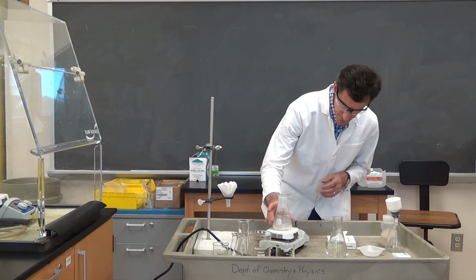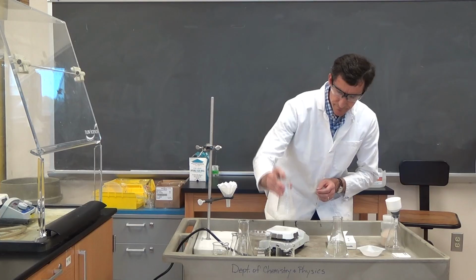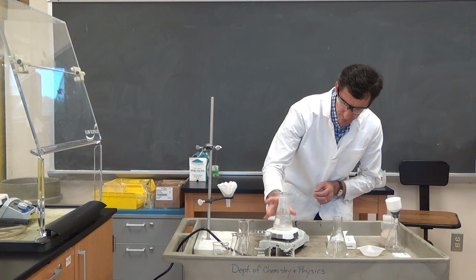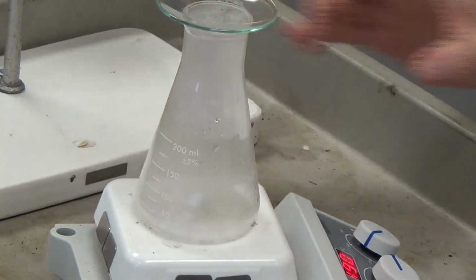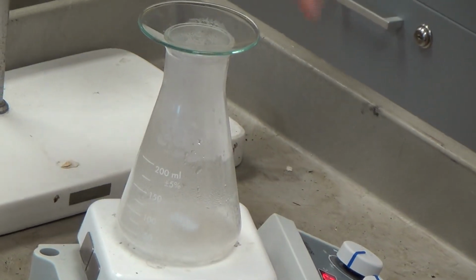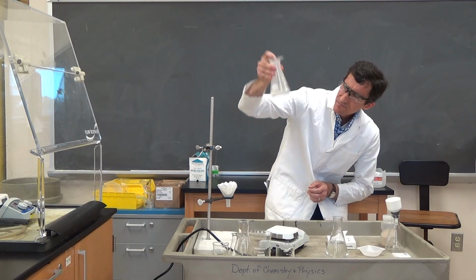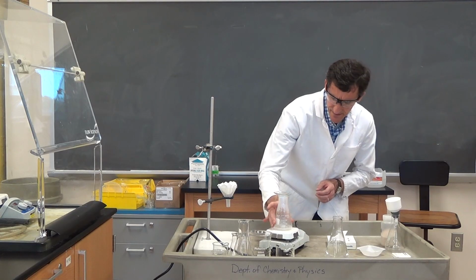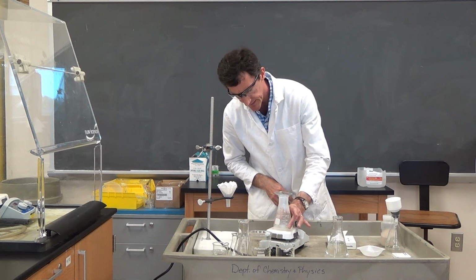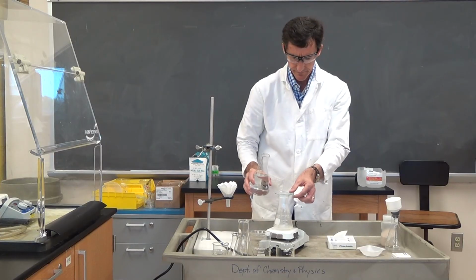So this is getting pretty hot. You can look at this. Looks like about half of my compound is dissolved. It's pretty hot there. I got vapor condensing on my watch glass. It's pretty much boiling down there. Benzoic acid is not completely dissolved. So at this point, I'm going to add more solvent.